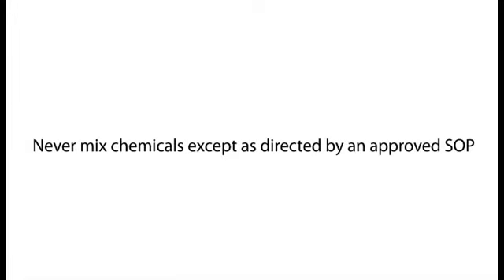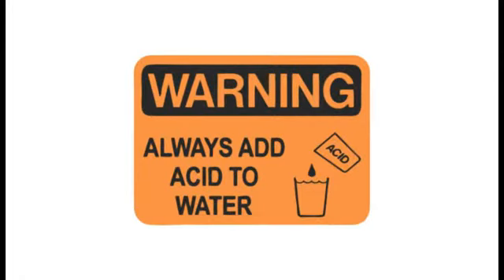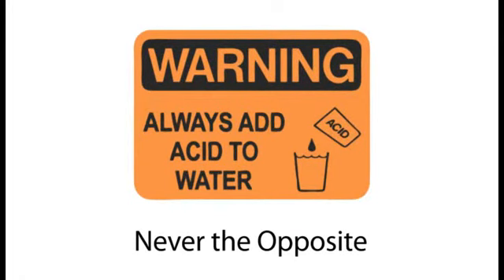Never mix chemicals except as directed by an approved SOP. Careless mixing of chemicals can lead to violent reactions. Also, always add acids or bases to water, never the opposite.